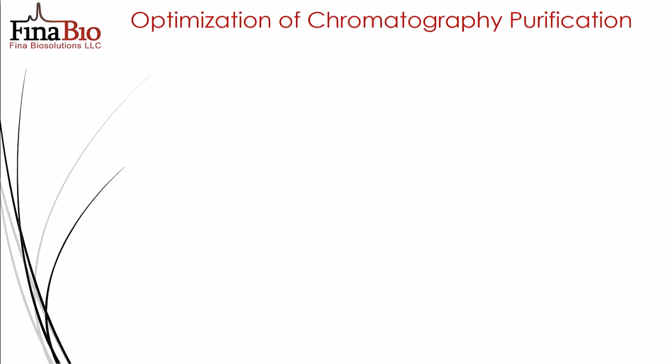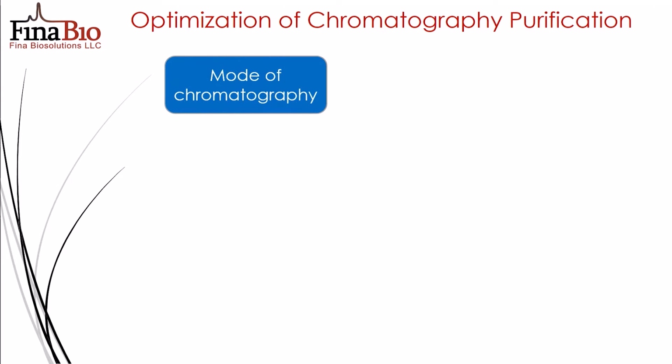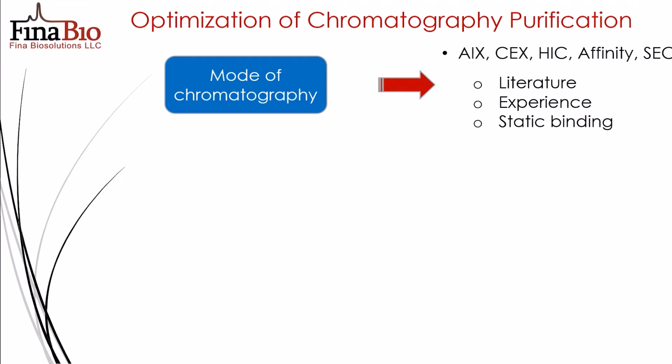In developing our purification for ttHc, we first considered the suitability of various modes of chromatography such as anion-exchange, HIC, etc., based on literature, experience, and some early static screening experiments. In our case, we found that anion-exchange and HIC were most suitable.